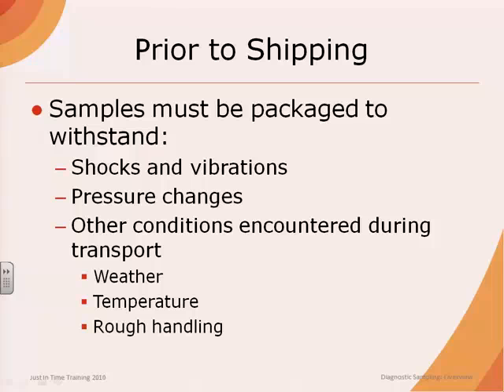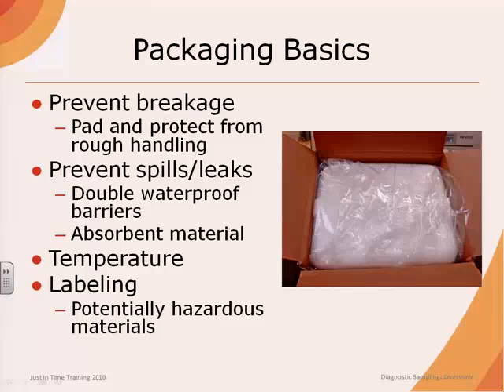It is essential to assess and ensure that packages will be able to withstand shocks and vibrations during shipping, pressure changes, and other conditions encountered during transport, such as weather, temperature, and rough handling. Therefore, when packaging the diagnostic samples, it is important to do this in a manner that will prevent breakage as well as spills and leaks, maintain the appropriate temperature requirements, and have the necessary shipping labeling.